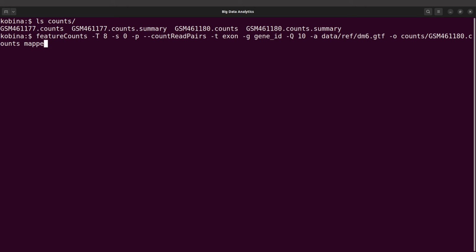So in that situation, we still maintain the options. Okay, we maintain everything here, but then the outputs and the inputs change. So this first group of commands will remain the same. So if you have multiple BAM files, then what you have to do is to say, let me just do it again. For the sake of beginners, I will just try to do everything again so that we can go through them one by one.